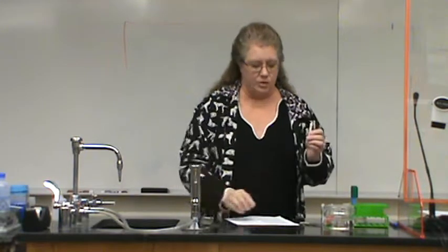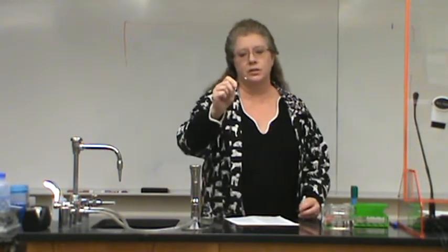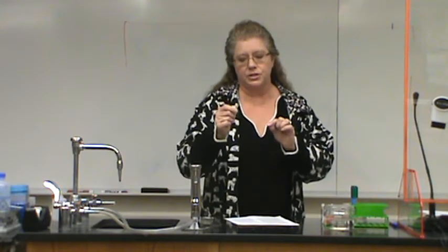Each of these cartridges, they're called cartridges, just have these little filter discs in them, which I'll push one out here, that have been impregnated with that antibiotic. It's a little filter disc that has this antibiotic on it. It's been soaked in it. It also already has the designation as to what it is. This is kanamycin, so it says K, and it also says the concentration, 30. So that will tell you what the concentration is and what the antibiotic is. You do not have to label them then. So it's very nice. Okay? So we have the cartridges with those discs in them.